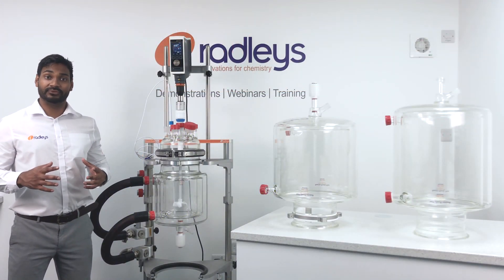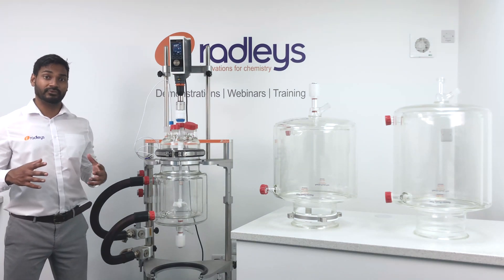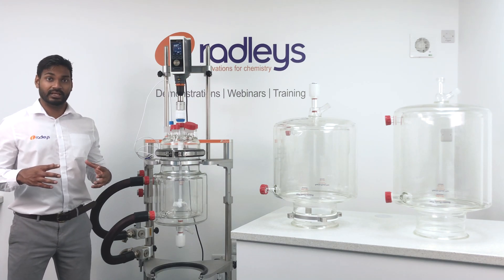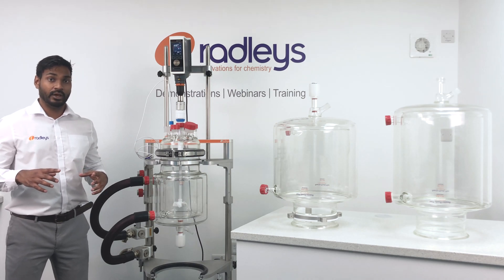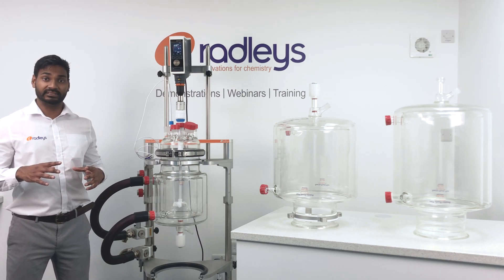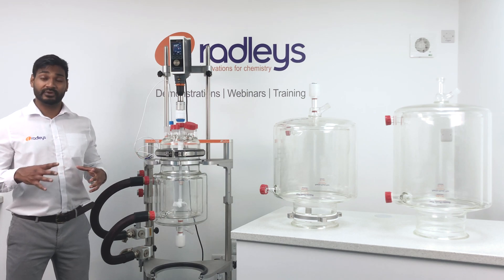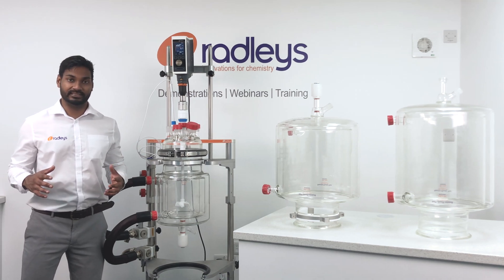Hi, I'm going to show you the Radleys Reactor Ready Pilot Jacketed Lab Reactor System, which replaces multiple reactor setups with a single universal pilot scale system that allows you to swap vessels in one framework quickly and easily. We have now expanded our range of vessels to include a 30L and a 35L vessel, so now we do 5, 10, 15, 20, 30 and 35L vessels.